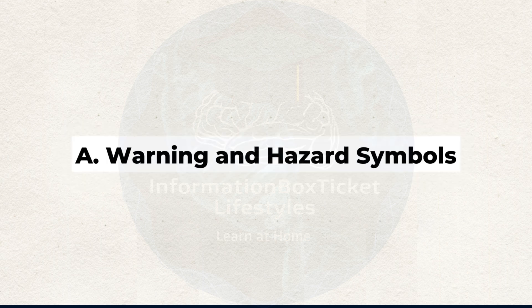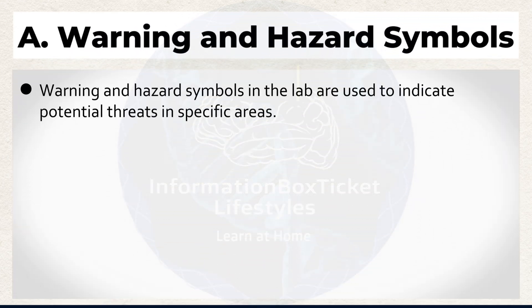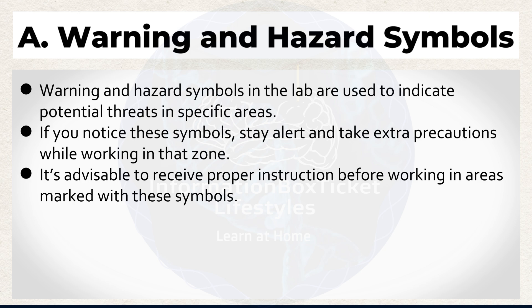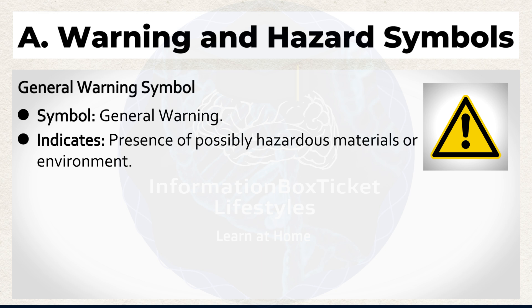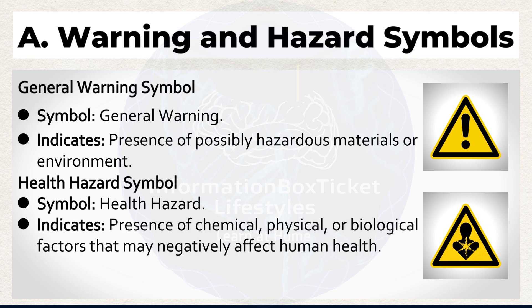A. Warning and Hazard Symbols in the Lab. These symbols are used to indicate potential threats in specific areas. If you notice these symbols, stay alert and take extra precautions while working in that zone. It's advisable to receive proper instruction before working in areas marked with these symbols. General Warning symbol indicates the presence of possibly hazardous materials or environment. Health Hazard symbol indicates the presence of chemical, physical, or biological factors that may negatively affect human health.